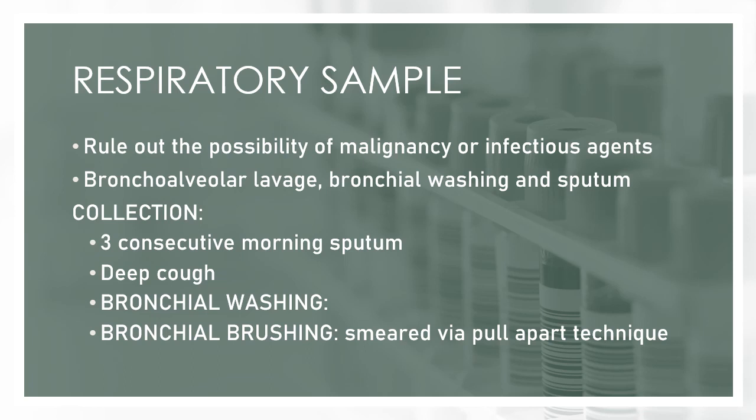Again, the sample should be as fresh as possible. You collect it in a wide mouth vial with Saccomanno fluid. Your Saccomanno fluid is a mixture of 50% ethanol and 2% carbowax.